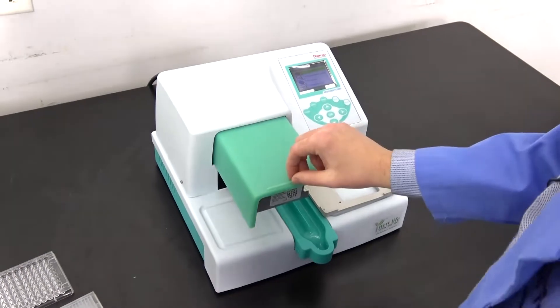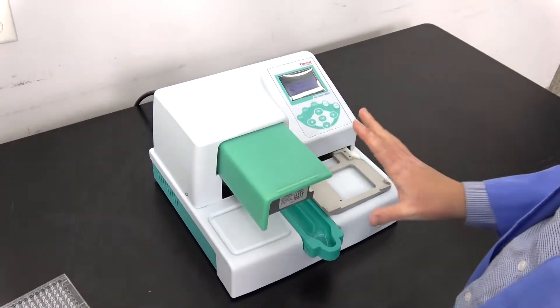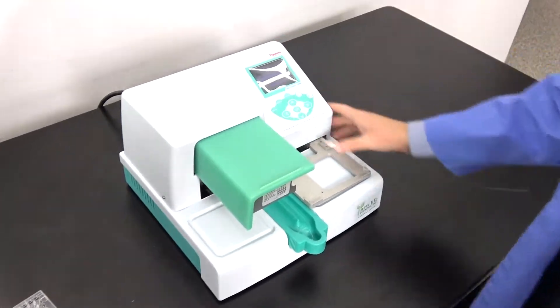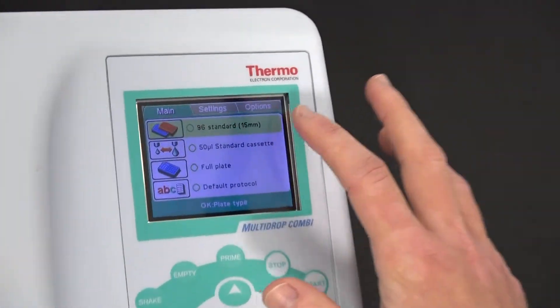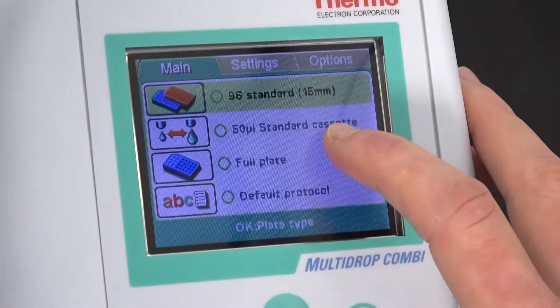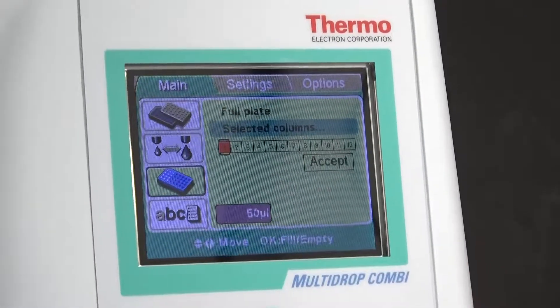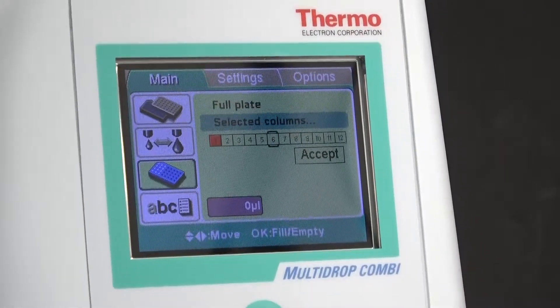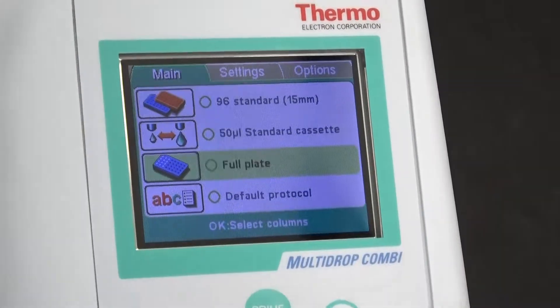This is a handy-dandy safety cover so that I can teach Bobby the undergrad how to use this machine — he doesn't get his fingers stuck in the peristaltic pump. If we go to the screen, it's really simple. You select what plate you're using up here, you're selecting your volume here, and you can discriminate between columns right here. You can actually select the columns in your plate, but we're going to do a full plate.